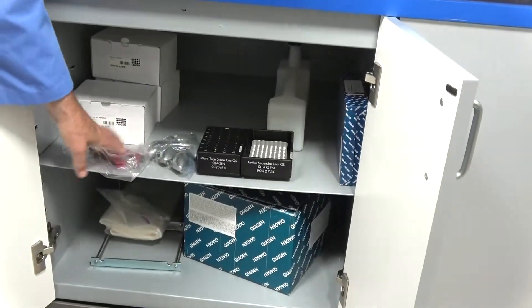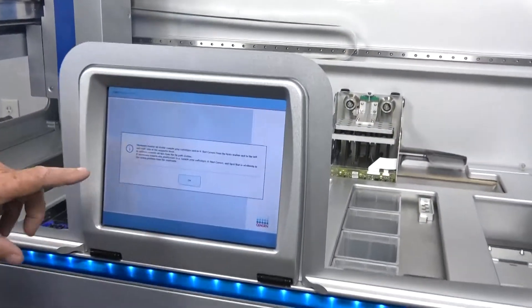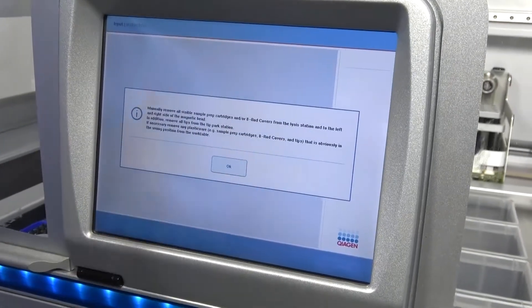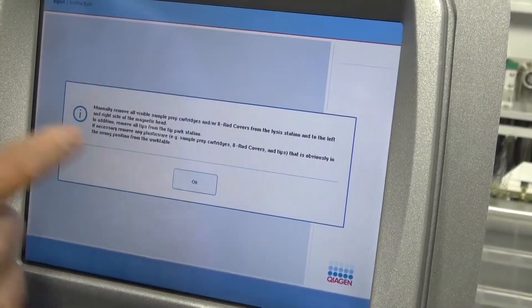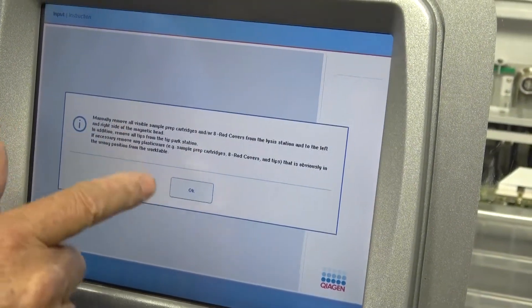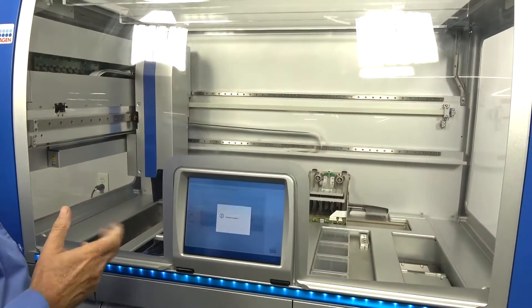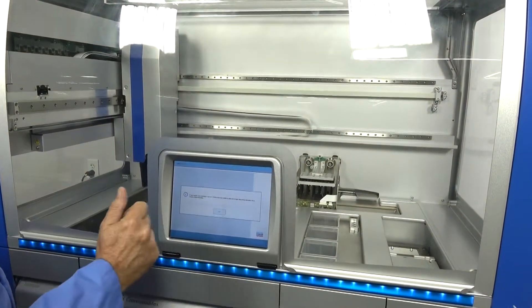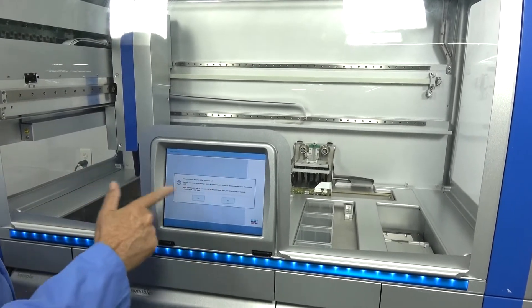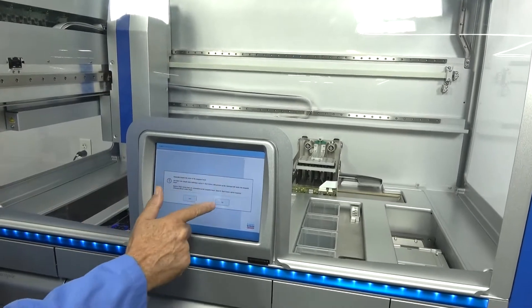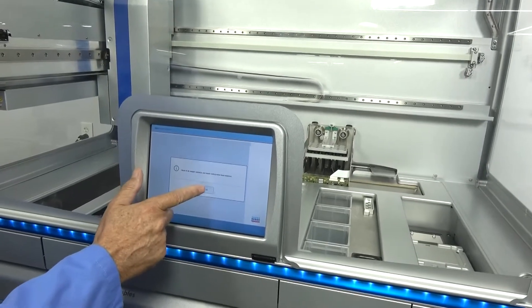Another thing, it's nice to know whether it comes with some of the others, and we're going to talk back because it's got more questions for us. It wants to make sure that there doesn't have a crash. It's telling you to manually remove some items, the tubes or things like that. You'll know what that means once you have one of these because it needs them to perform the protocols, the assays that you're going to be running. It's telling you to check, make sure any visible sample prep cartridges are available. We want to manually remove them. Are we sure that there's none available? Basically what it's saying.